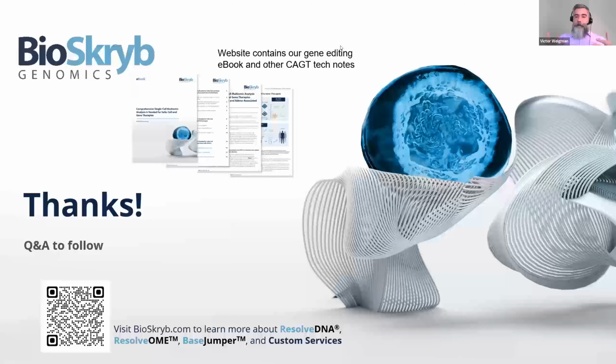Absolutely. So, to be super brief here, as we open the cell in order to allow access to the DNA, the starting primers are chosen as really random. As the amplification is happening, and this workflow is on our website, I recommend people look, as we have some really nice videos there to check out, you have a terminator coming on top of those. So when a polymerase is trying to do another round of amplification, which is what PCR does, where one gives rise to two, gives rise to four in traditional PCR, here that termination process drives the polymerase back to the primary strand, along with the randomness of the starting spots.